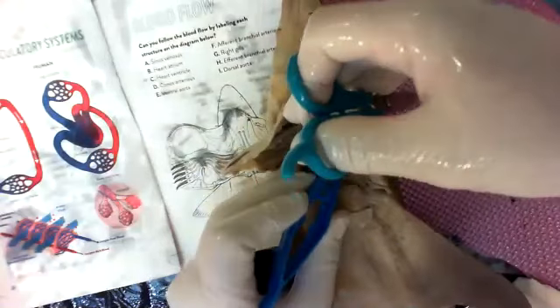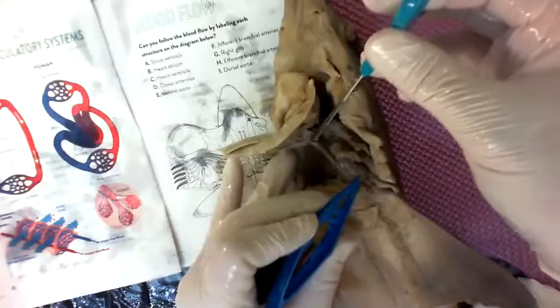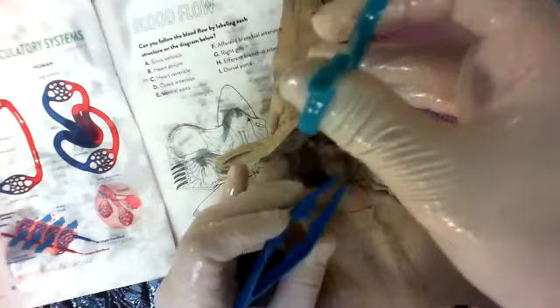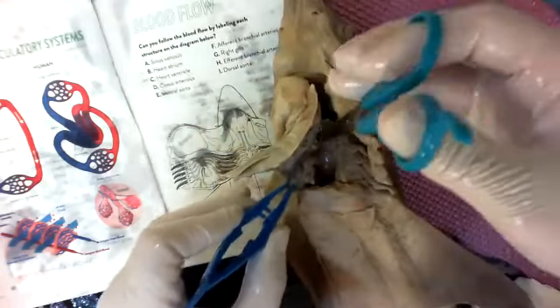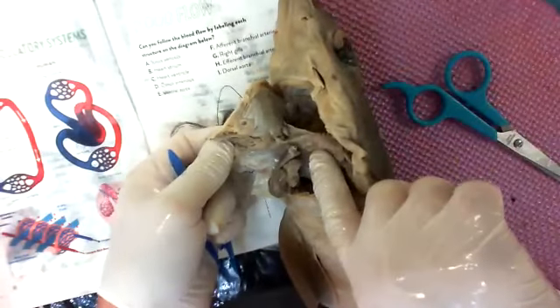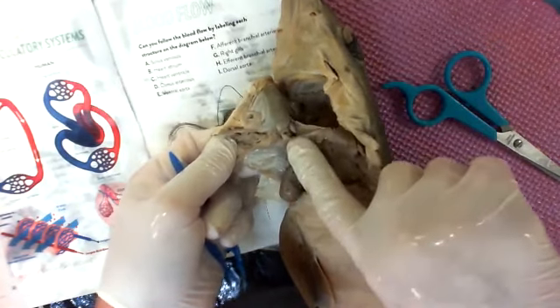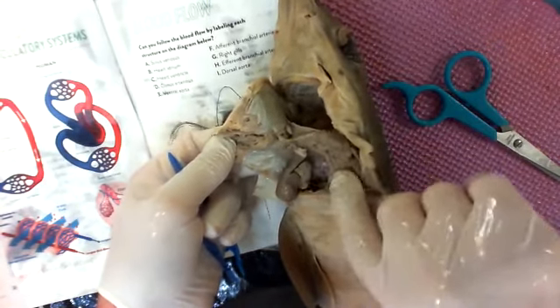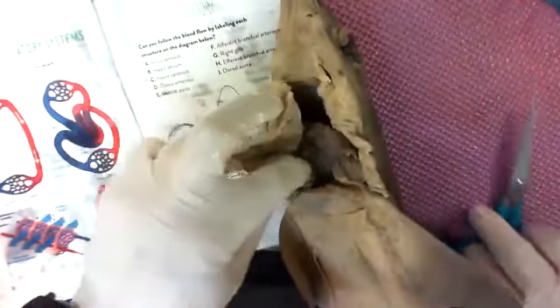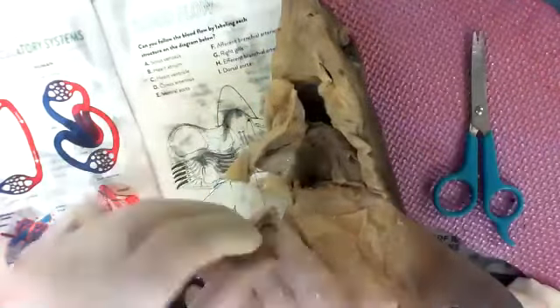So let's move this around a little bit. And I'm cutting way up there. I can actually see where it's going to split. So I'm going to cut at the split. Snip. Didn't quite get it all. So I'll cut a little bit lower. Snip. And I had just seen, before I cut it, I'm pushing on this and I can see little bubbles coming out. There's a blood vessel and I can see the hollow center. Pushing down here, I can feel a blood vessel right there. I think we're completely, nope, not completely. Snip, there it is. Boom.